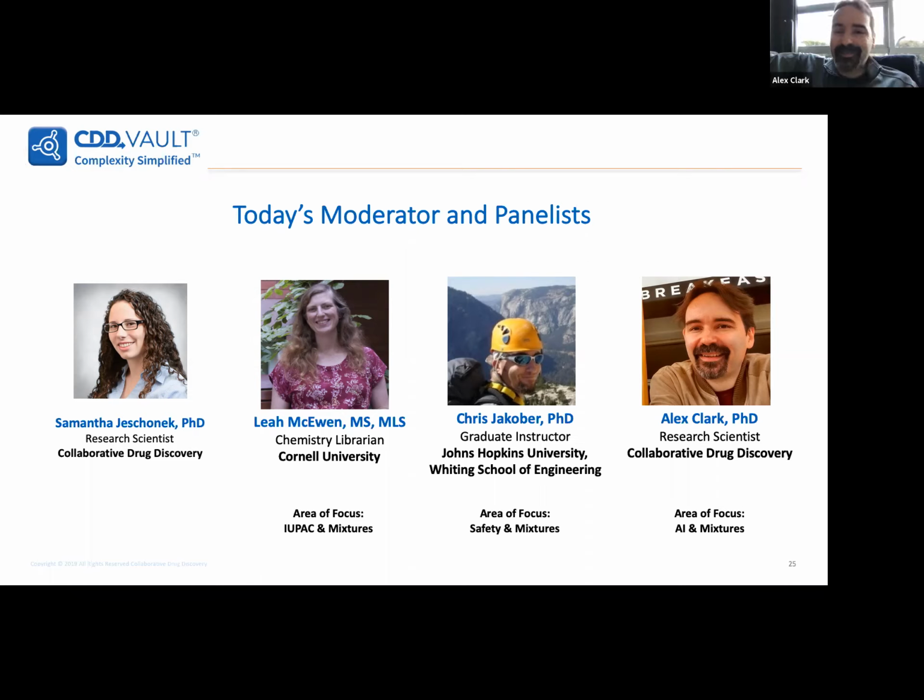Yeah, I'm not sure how to divide those two words between each other, but I would say fundamental and non-fundamental. I think we've covered our thoughts on that. Yeah, that's one way of thinking about it. I think this is really a description, right? MInChI is a type of description. So in that sense, it's metadata. The measured data, if you're thinking about data that way, is living in different data stores, and the ability of the MInChI to help us link between those data stores is the value here.